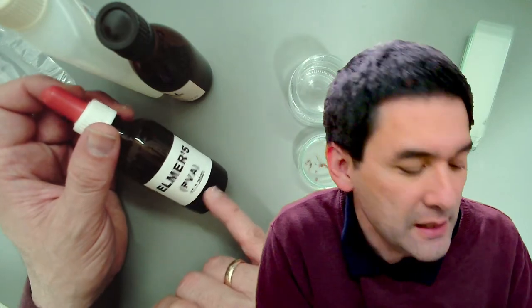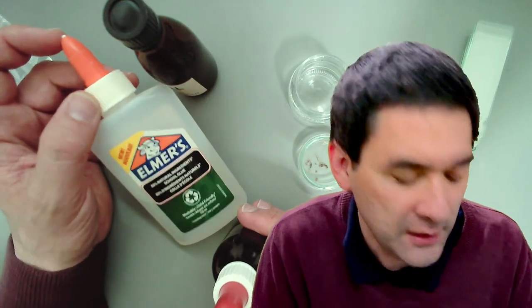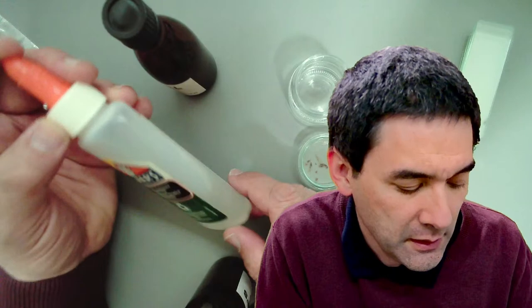Okay, this is a commercial glue. I've got the bottle over here. This is how it looks. You can order it over Amazon. It is a water-based glue. It is safe, so it does not contain any organic solvents. As a matter of fact, it even says here it's child-friendly, and it's completely clear.